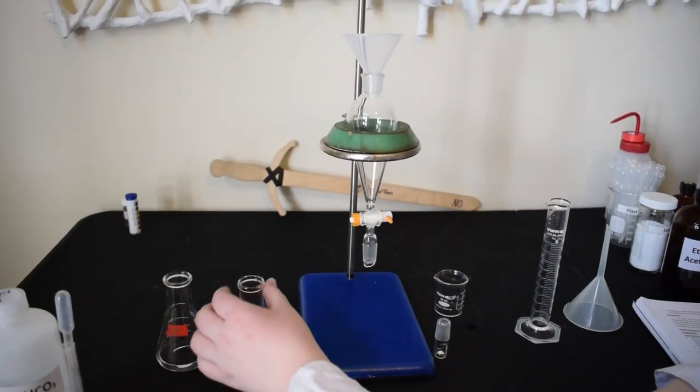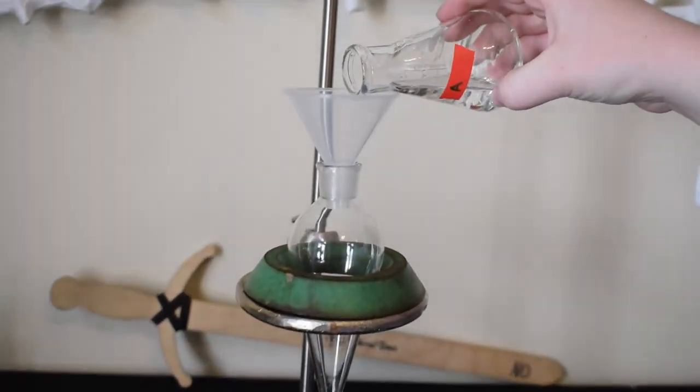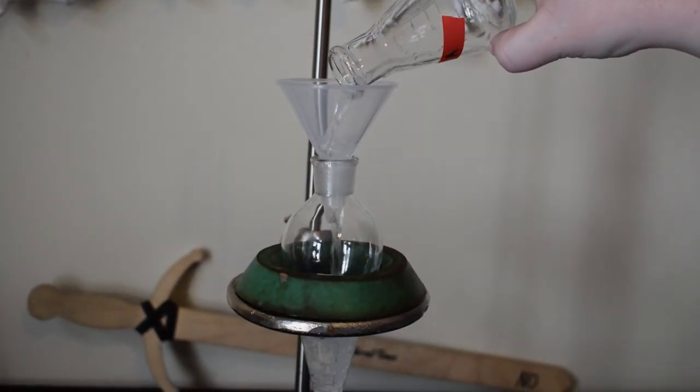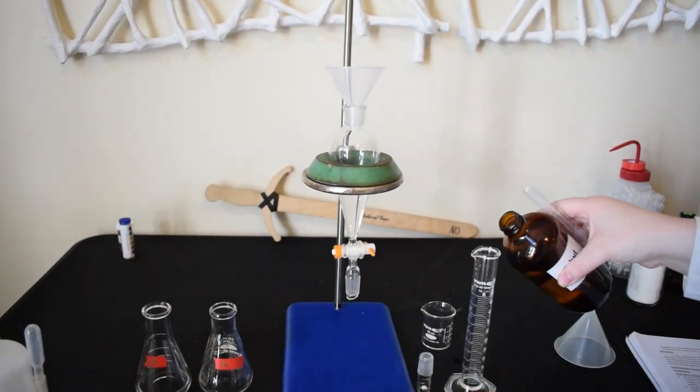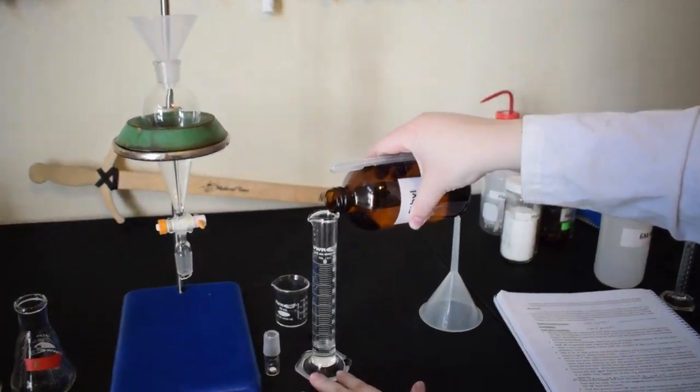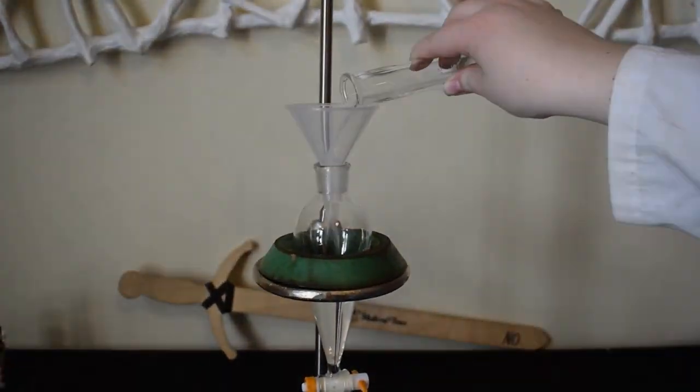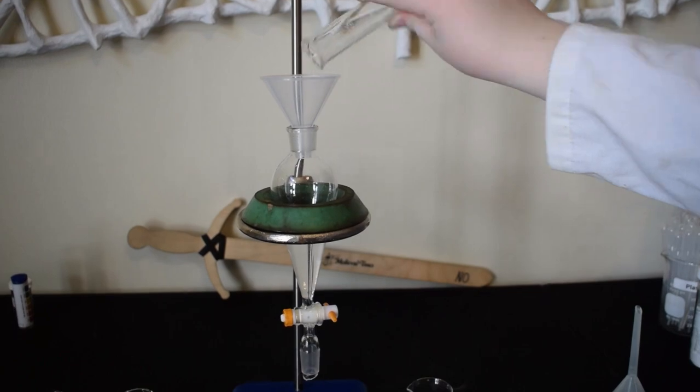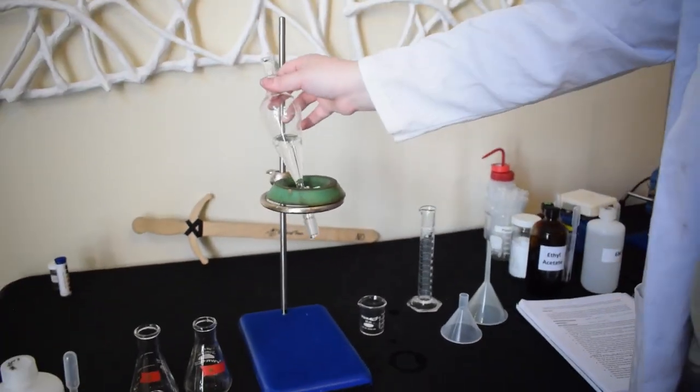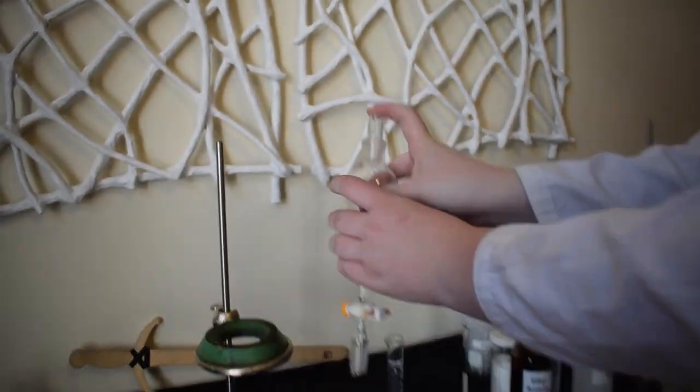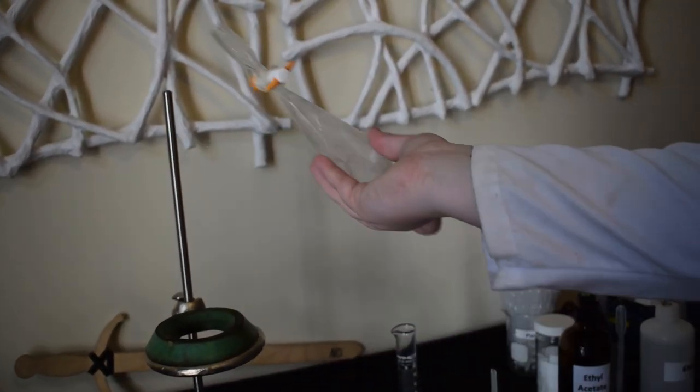Now we are going to take the aqueous layer and add it back into our separatory funnel, making sure that the stopcock is closed before we begin. To that aqueous layer, we are adding 10 more milliliters of ethyl acetate. The purpose of this second wash is to remove any acetaminophen that might still be dissolved in the aqueous layer.